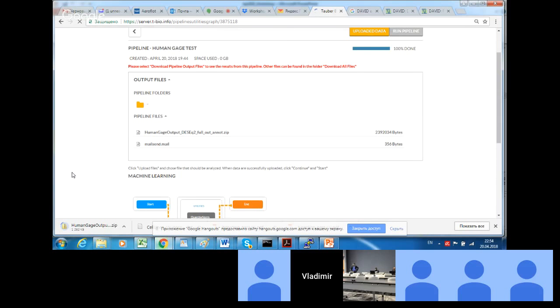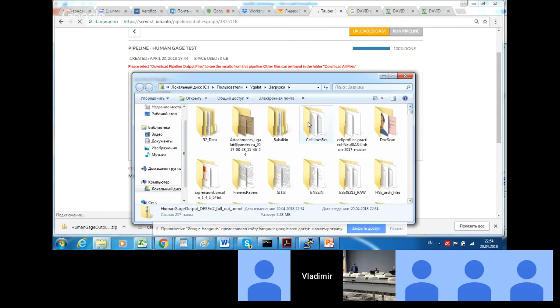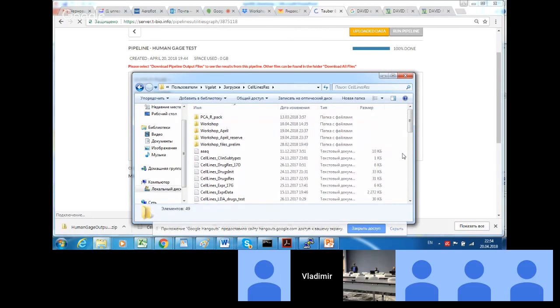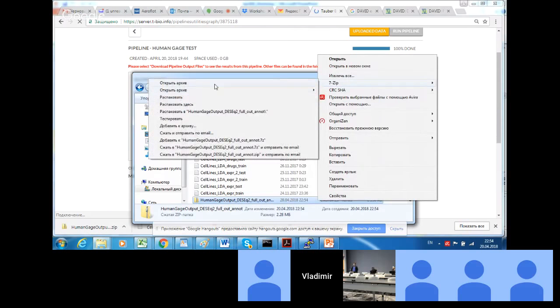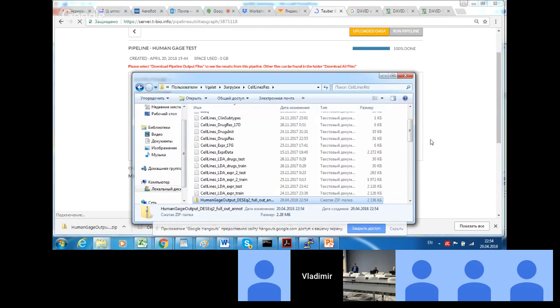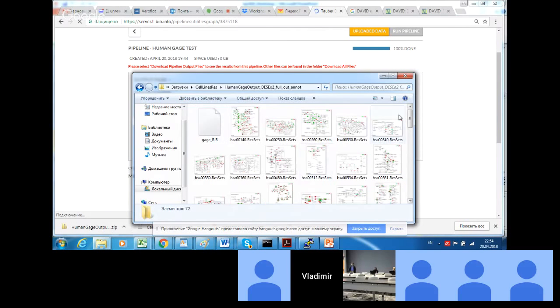Inside this archive, what we'll have, just a second. So here's this archive. I just unzip it somewhere. So what do we have here?